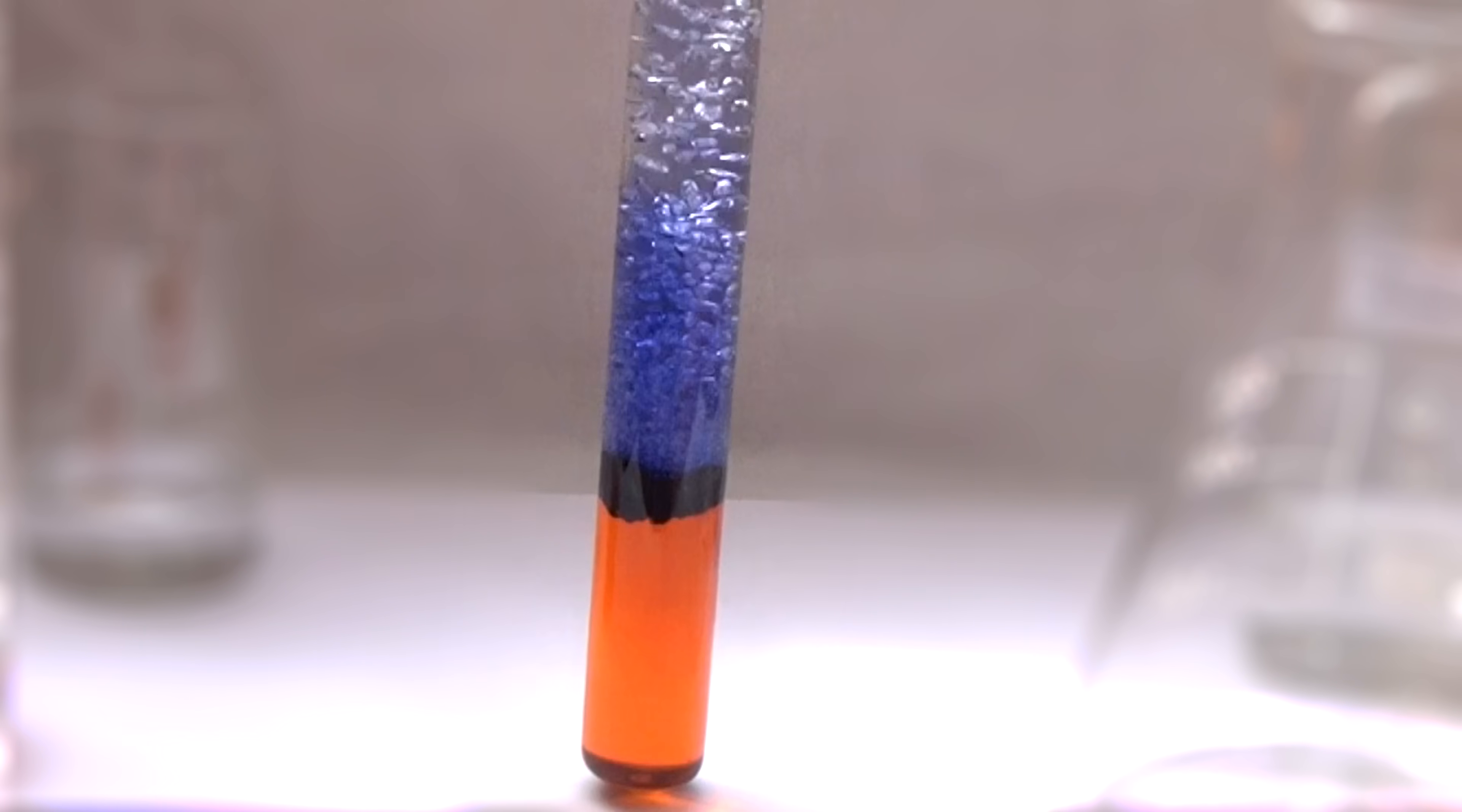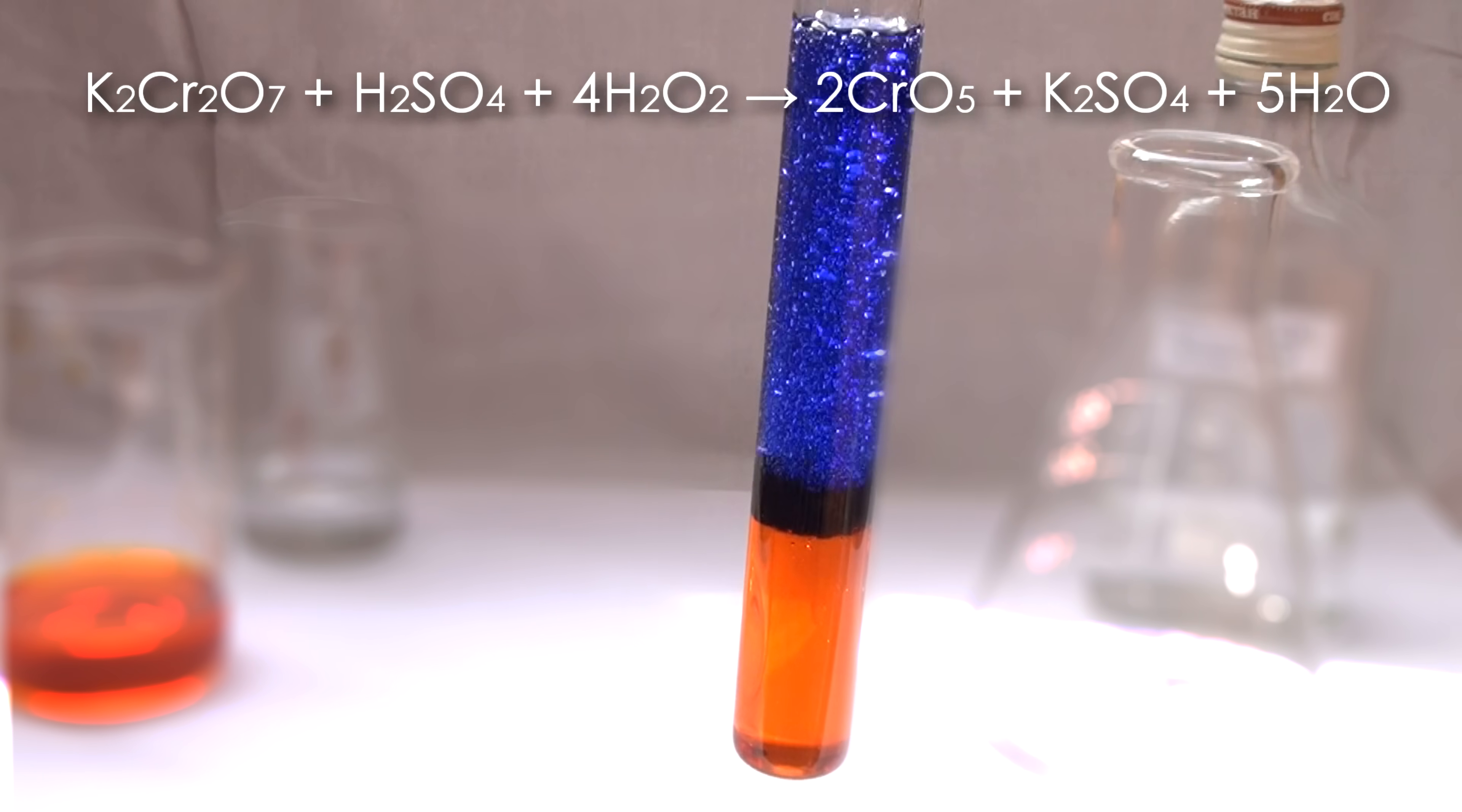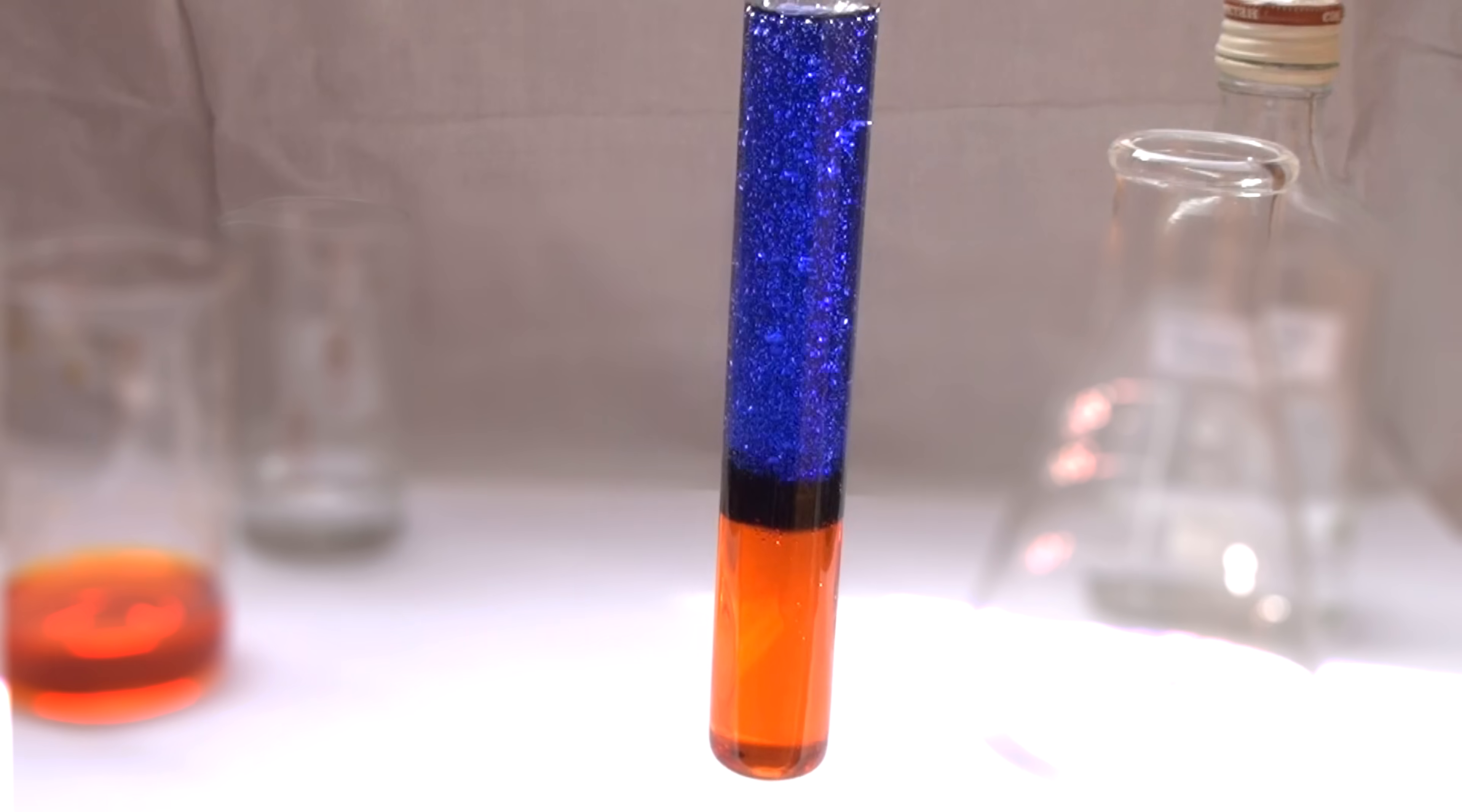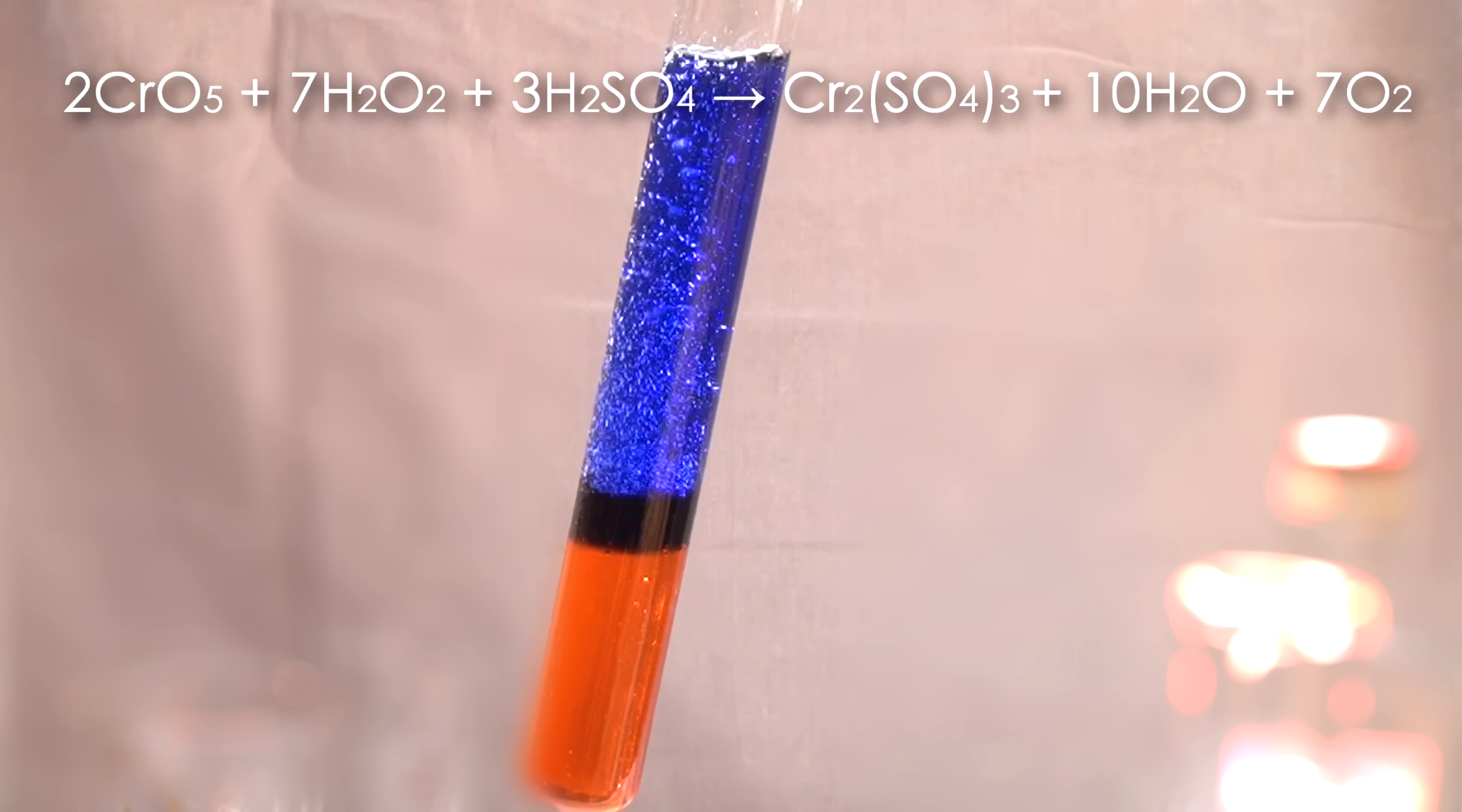And to start the reaction, add a few drops of 20% hydrogen peroxide into the test tube. After adding the hydrogen peroxide, a very interesting transformation occurs. Fluid between the layers of ether and potassium dichromate becomes dark.